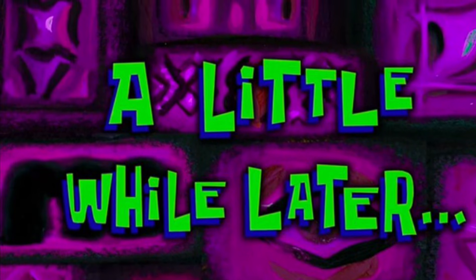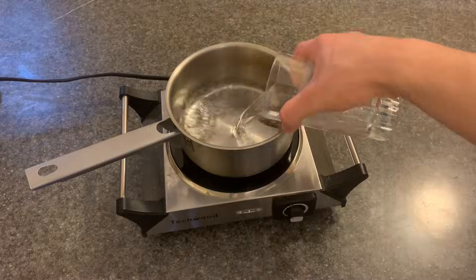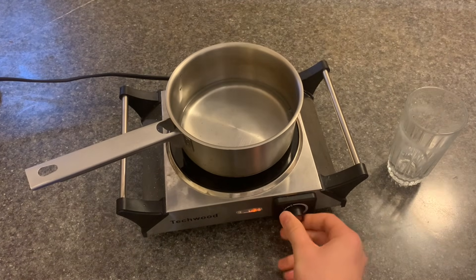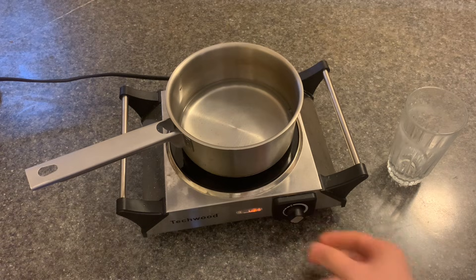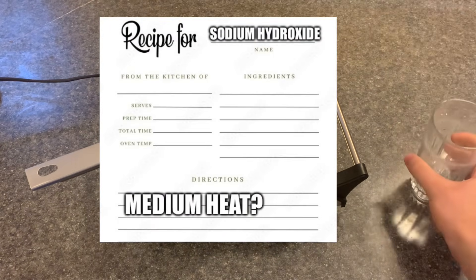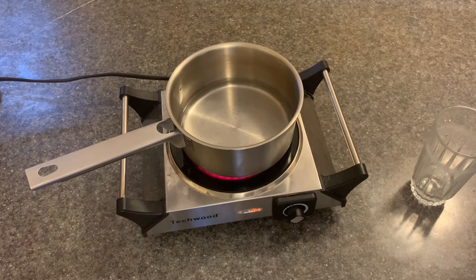A little while later. Now I'm just going to boil it, and this time my plan is to get rid of all the water completely. Cooking this thing on medium heat. Now I'm just going to wait until there's hardly any more water inside of it.